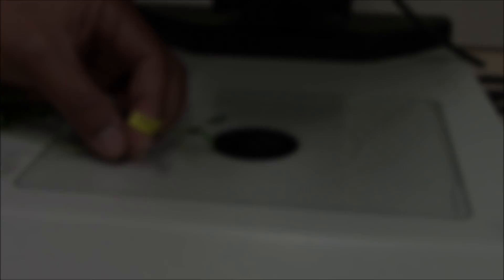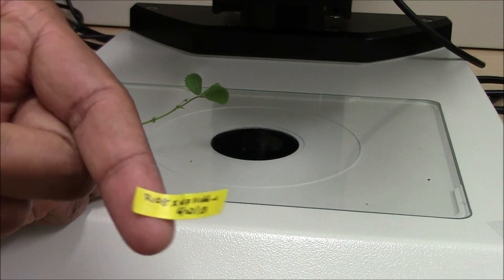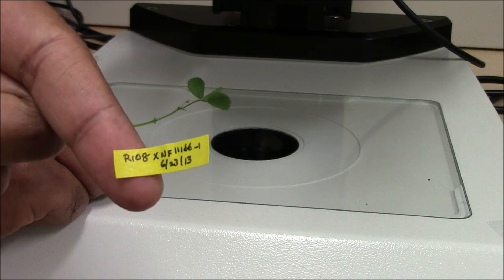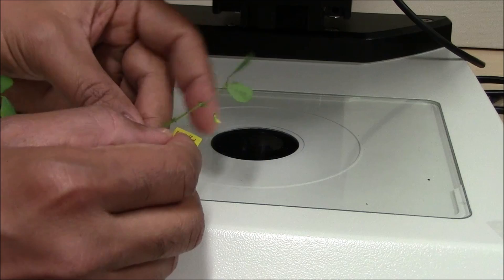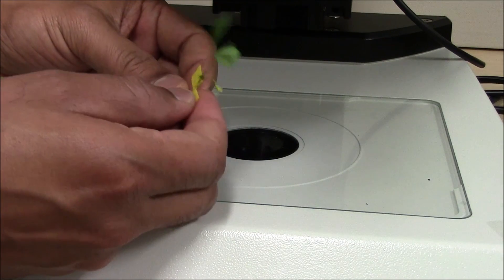Label the pollinated flower by placing a folded sticky tape with the name of the male and female parents and the date of crossing just under the pollinated flower. Avoid covering the artificially cross-pollinated flower bud using transparent tape or wraps, which could promote fungal growth that results in flower decay and flower drop.